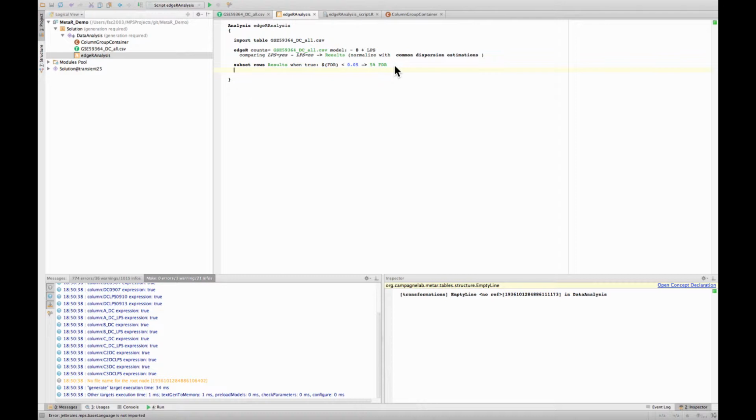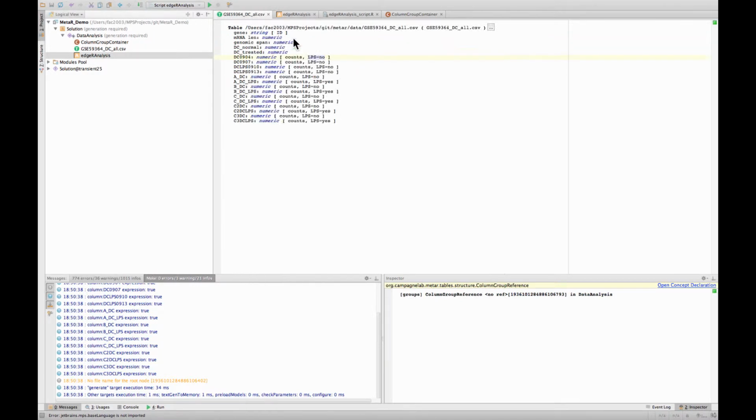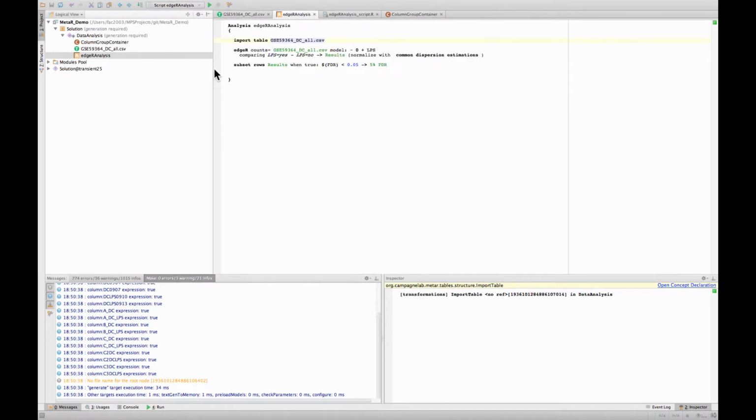Once I've created the subset, if I look at the table, I realize that I have the gene IDs, I have the FDR, which allowed me to filter and keep only the 5% FDR top results, but I don't have any counts, so that's a problem to create the heat map. The counts, however, were in this table that was used as a source, right? We actually annotated each of those columns with the counts attribute.